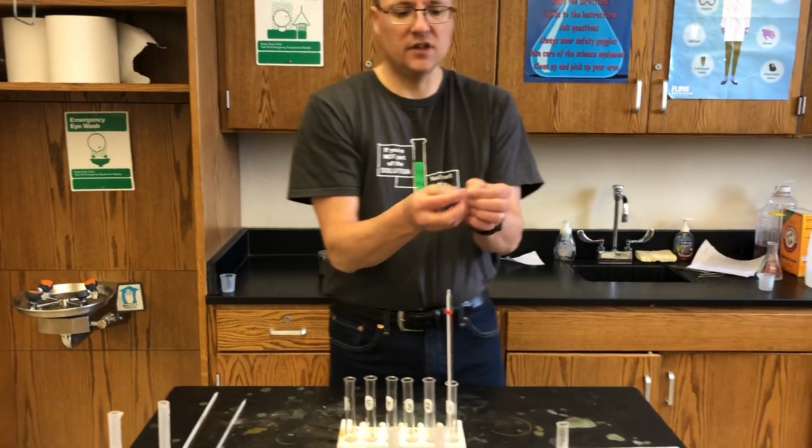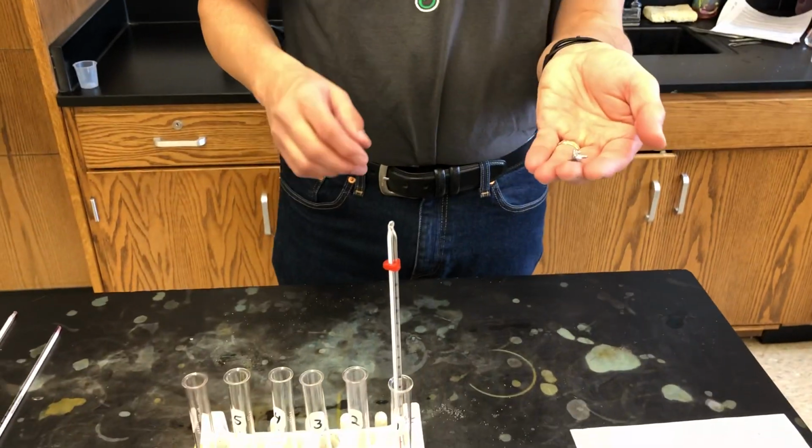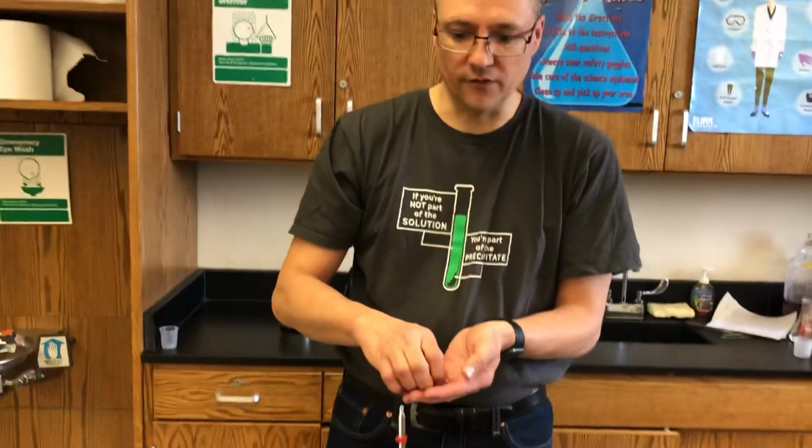Next, I have these pieces of zinc, which I'm going to fit into the test tube. And what we're going to do is measure the initial temperature, or the starting temperature, and then the final temperature. And we're also going to be looking for any changes that we observe.